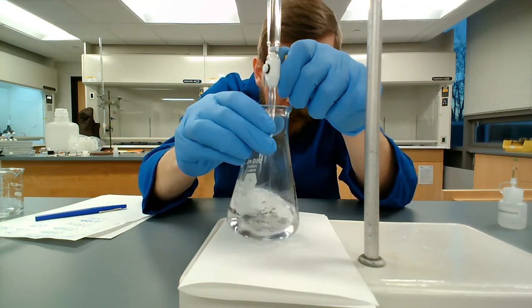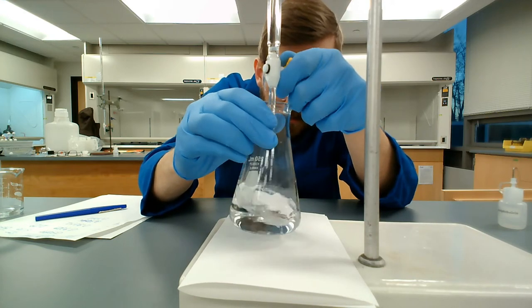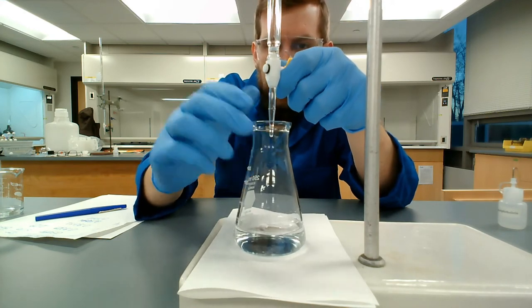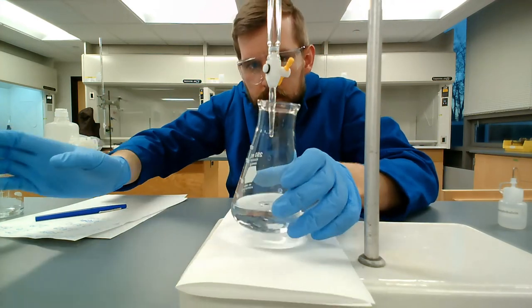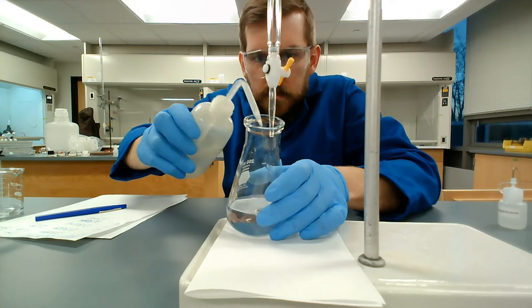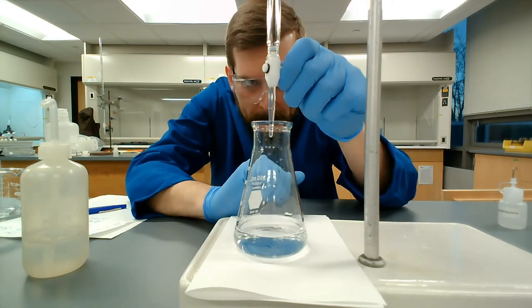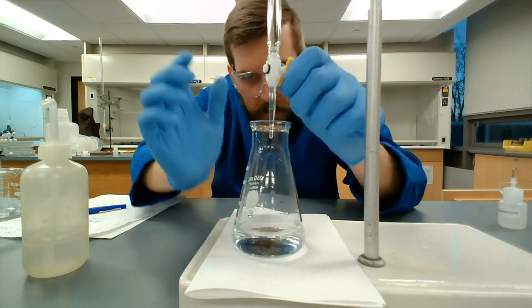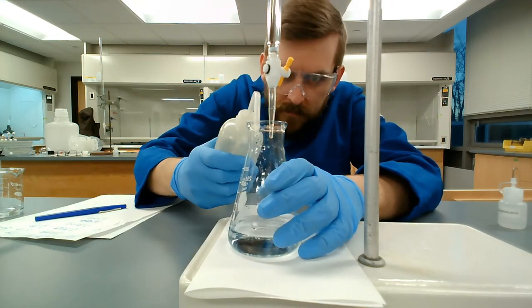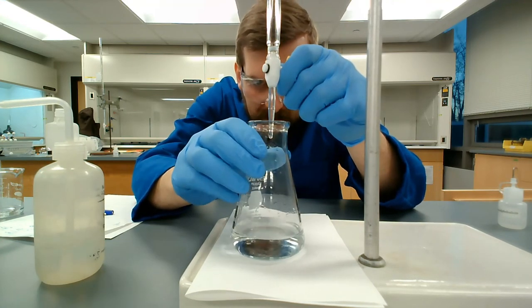Once I see pink start to persist, I start swirling vigorously with still a wide open stream. Once I see that pink start to persist, I'll slow down to like a drop every second, you know, every half a second. Again, that was me tapping off the tip of the burette because it had dispensed. Right there, I'm rinsing the sides down to get that sodium hydroxide into the bottom.